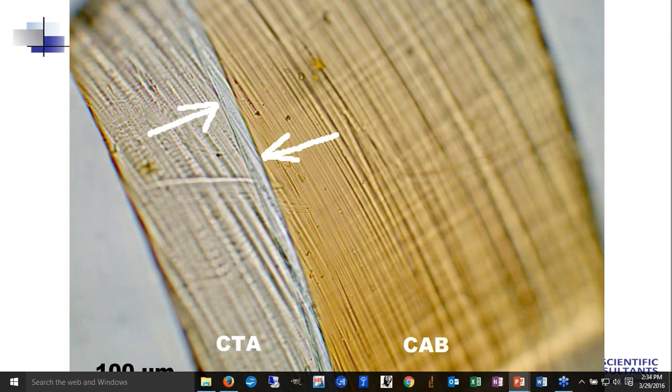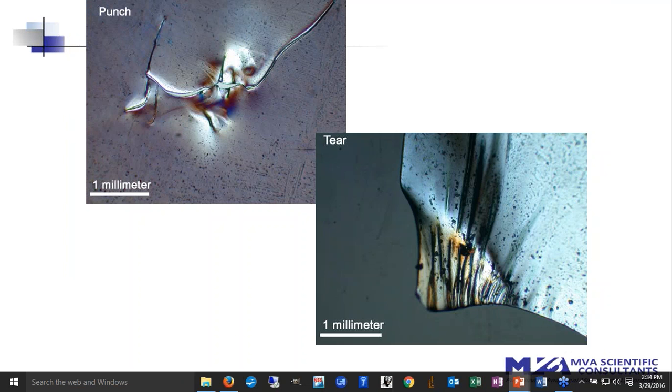Occasionally we're asked how things are bonded together. There were two different polymers. It was not apparent to the customer that there was a bonding layer. Just with a quick simple hand section, we were able to demonstrate that there was a bonding layer and then provide them with information as to what that bonding layer was.